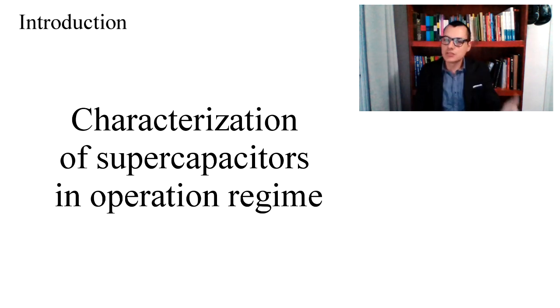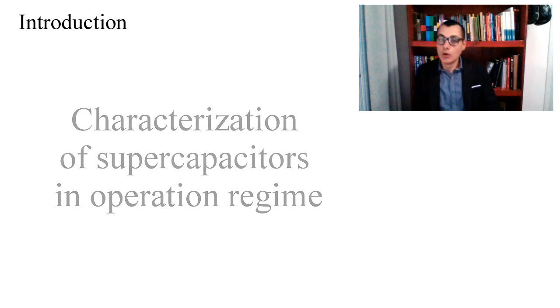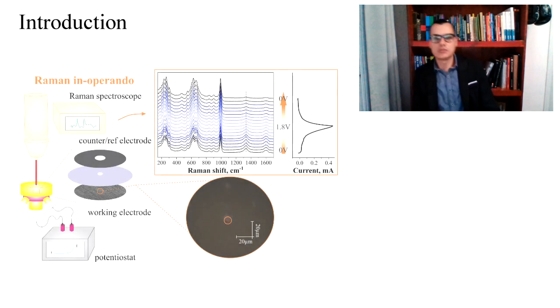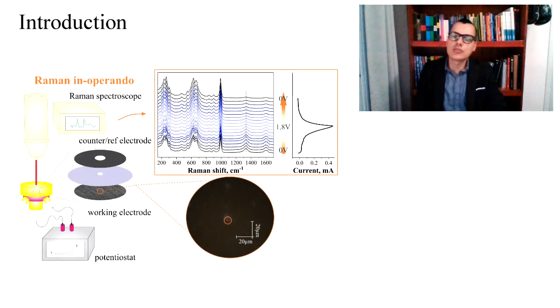Like this, other studies have been done to monitor the intrinsic electrochemical processes under the operando conditions of supercapacitors. With this in mind, our group carried out Raman studies under operando conditions on the electrodes already presented in the introduction. We used the carbon-based materials decorated with niobium in this case. This work concerns the use of these carbon-based electrodes in lithium sulfate aqueous electrolyte, representing the real working process of these electrodes.